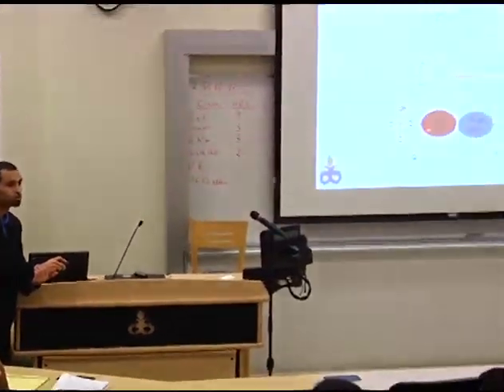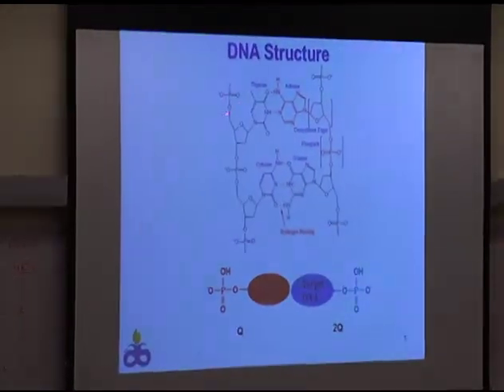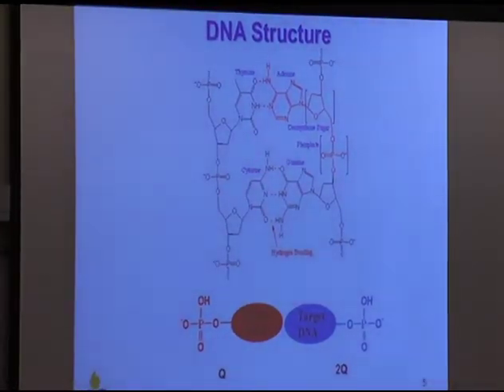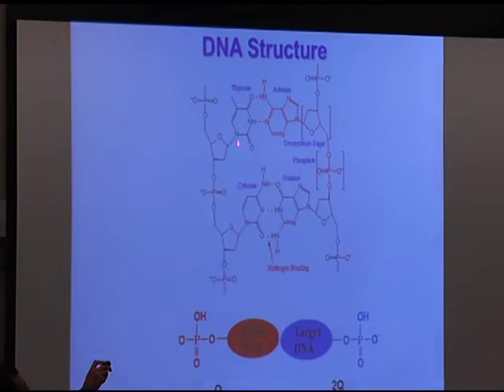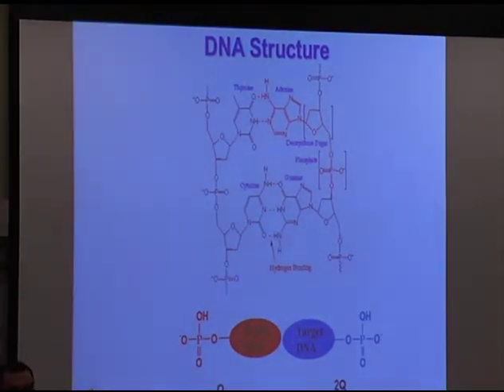I can determine what target this hybridizes to based on the sequence of the probe. If I change the sequence of the probe, for example, it's TAA, then what would hybridize with TAA? ATT, right? AT&T. Here, this is just 2 bases for my probe and also 2 bases for the target.